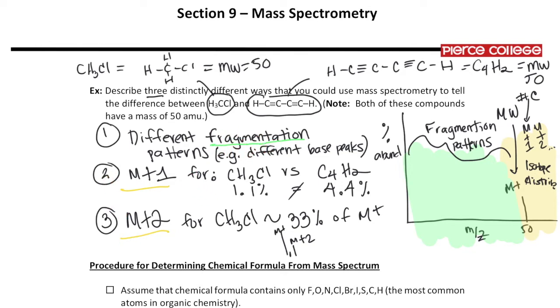This helps put the structure together. In this region, this could actually give us specific numbers of atoms present. And so we're going to expand on this idea and try to actually pull out, if that data is provided, the information that will lead us to potential molecular formulas.